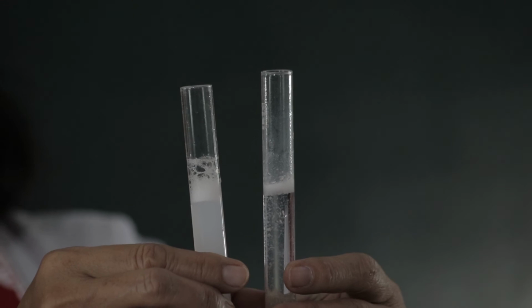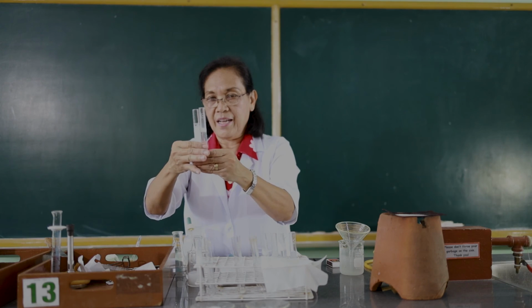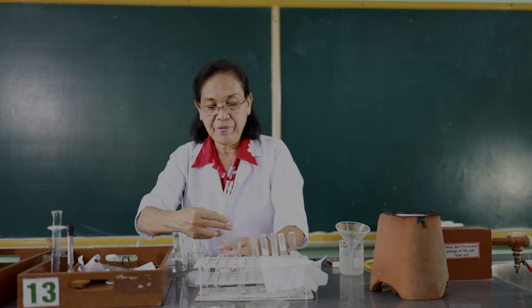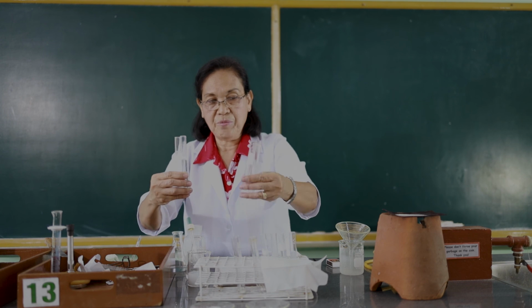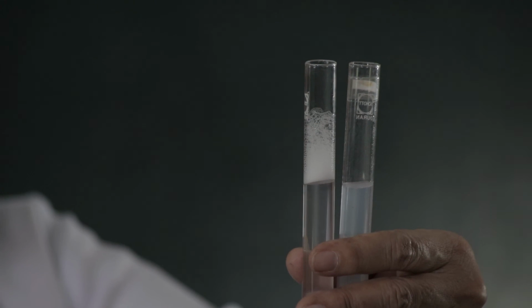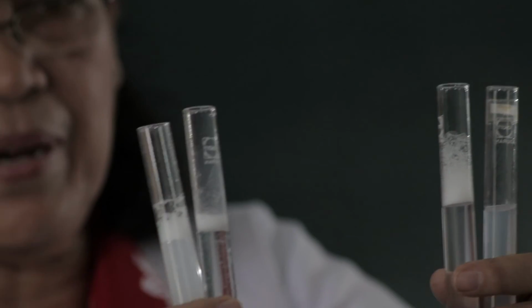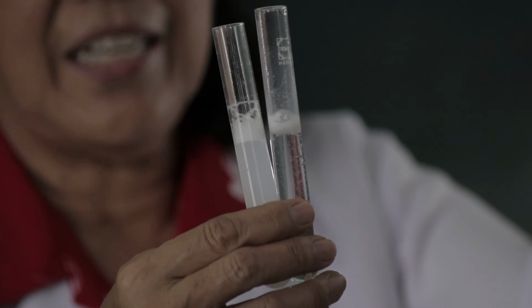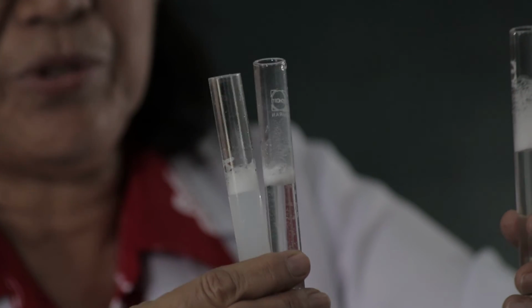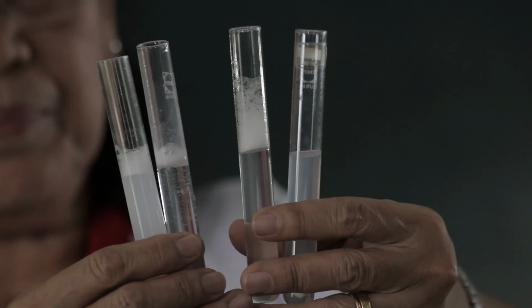Observe and compare. Okay, and I want you to compare that with the previous test tubes containing the distilled water with the soap solution and the detergent, and the other two contain the calcium chloride solution. One is having the soap solution and the other one has a detergent solution. Compare.